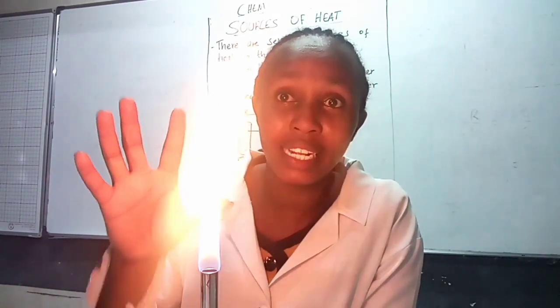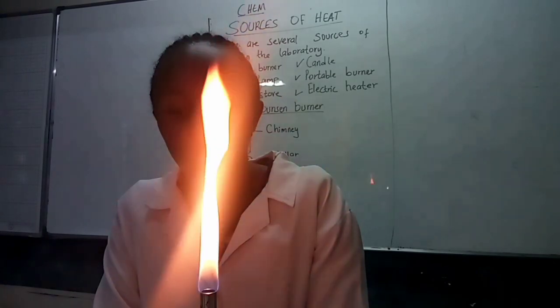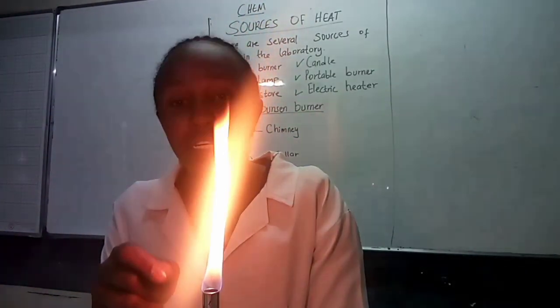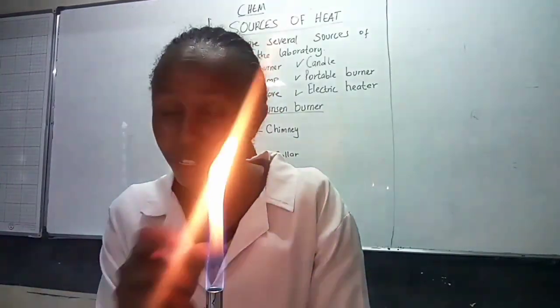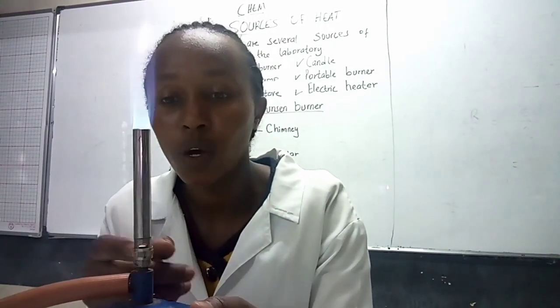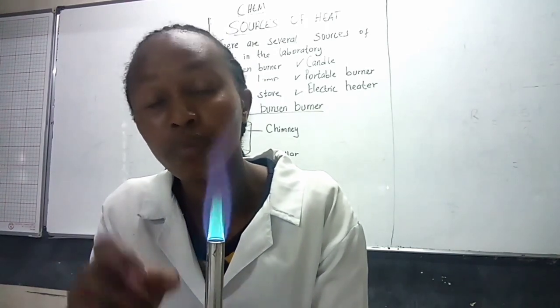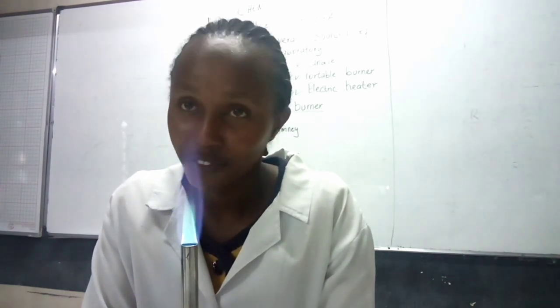Now this luminous flame, you can see it is very large and also not steady — it is wavy. Some of the differences: the luminous flame produces light, it is large and wavy, it is not good for heating because it produces soot due to unburnt carbon particles, and it is produced when we completely close the air hole. When you open the air hole, you form the non-luminous flame, which is short and steady, very hot, and blue in color. So next time you are in the lab and need to heat, you know which flame to use, and also which flame to use if you want to avoid a fire accident when practicals are ongoing.